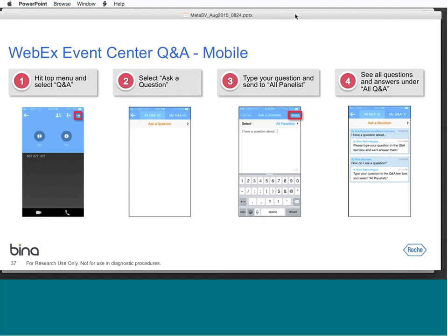Okay. The next question: how does MetaSV perform on DNA from FFPE samples compared to fresh? Well, we haven't had a chance to assess those kinds of samples, and we are working on doing more assessment of MetaSV on different kinds of samples.